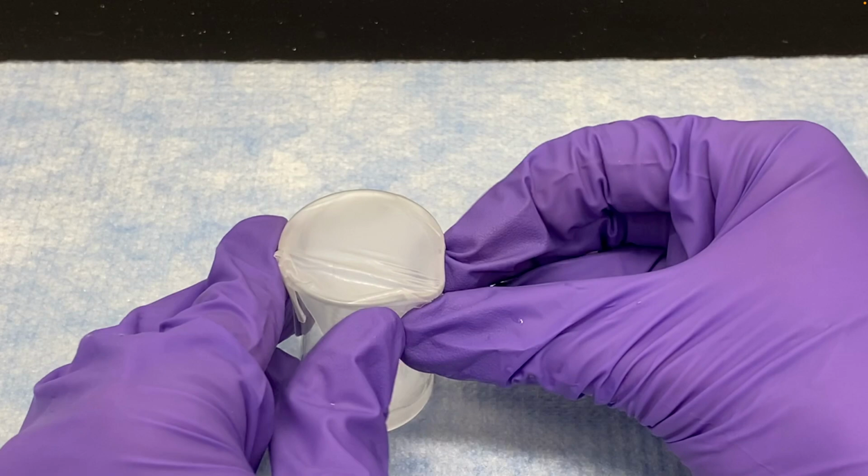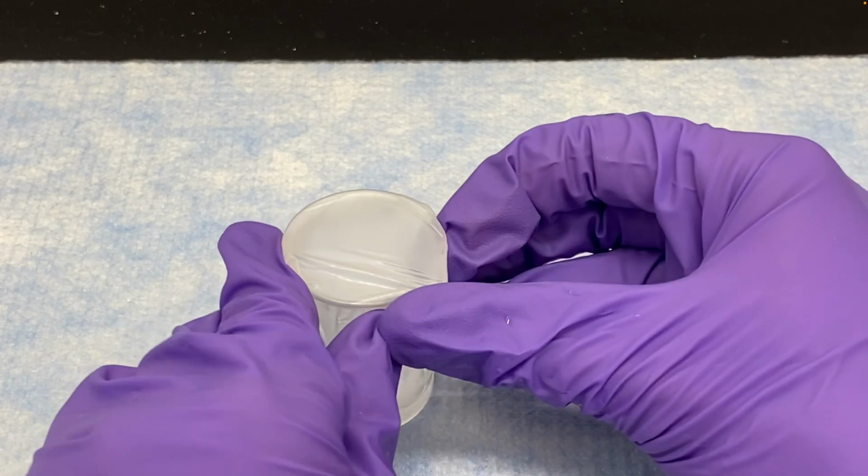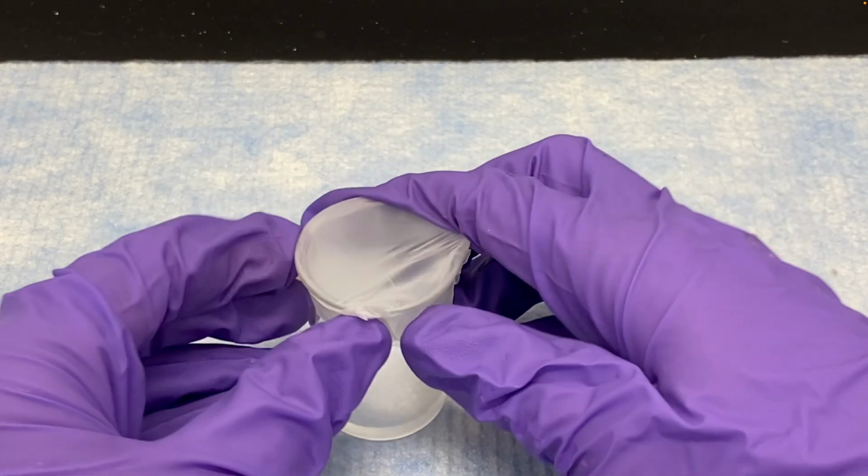If you wanted to collect the actual camphor, which is something that we're not going to do in our lab, you would want to decant this solution. Decanting is where you separate things by pouring them carefully. So you'd pour this so that the liquid goes from this container to, say, another beaker, but the solid sodium sulfate does not. You can use something like a glass stirring rod to hold the solid back. And then once the liquid is in the other container, you can evaporate the liquid away.